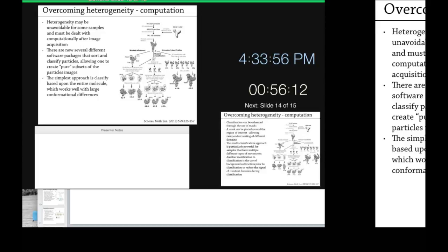This is where they're able to take this little bit of the arm, calculate that, and they can see already with the initial 3D classification that there's a lot of different classifications. And so what they wanted to do to try to build up the signal, because this arm is only 10%, to see if there's any correlations. Does movement of the arm correlate with movement of the body? And can this help you to build a better reconstruction of the arm itself?